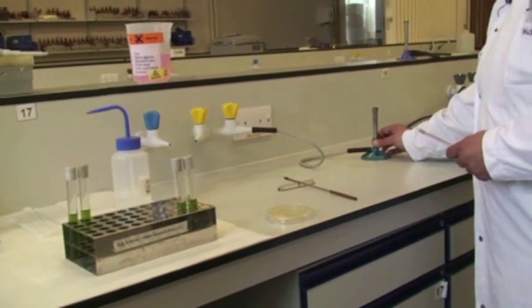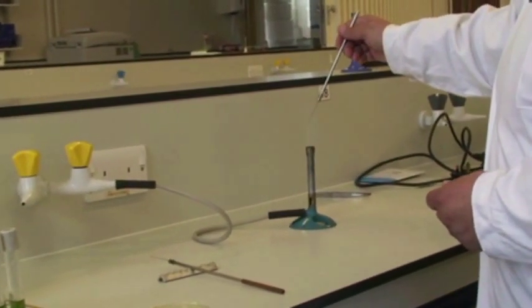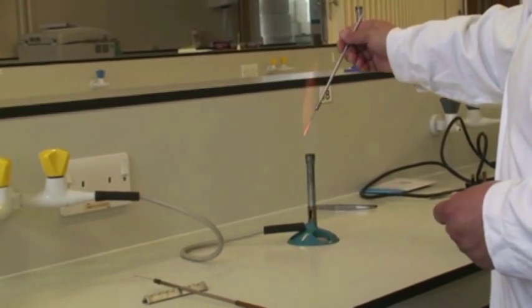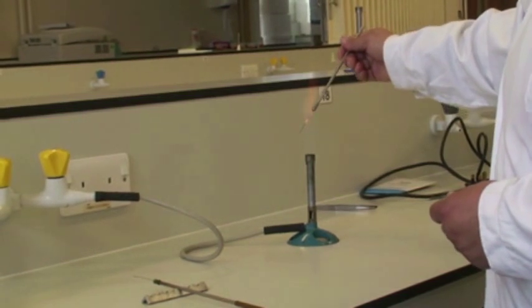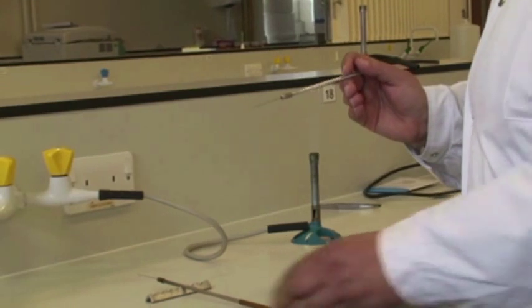I'm moving the Bunsen again to the hottest part of the flame, sterilizing the straight wire till it's red hot, because you want to make sure that the only bacteria you are actually inoculating into those Hugh and Leifson's agar media are just the bacterium that's on here.